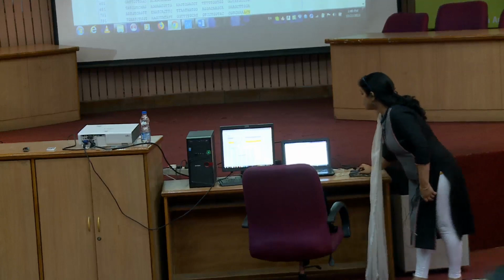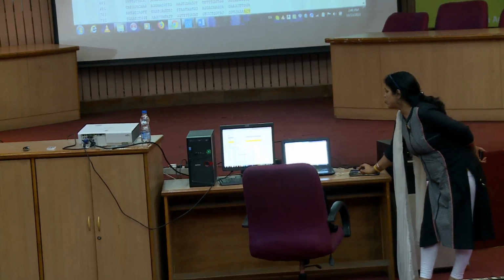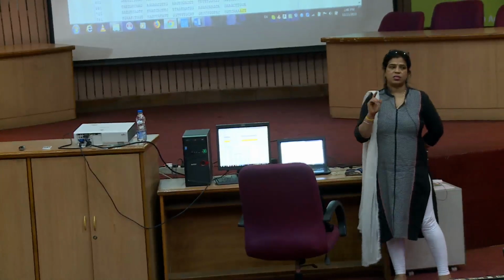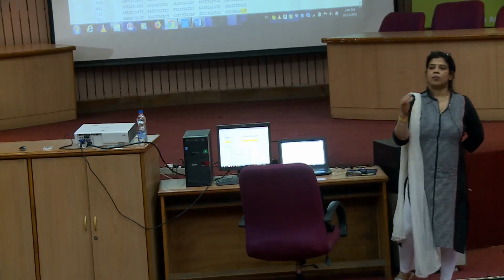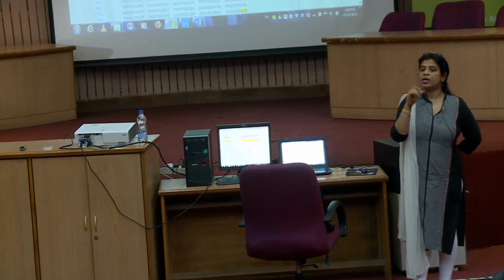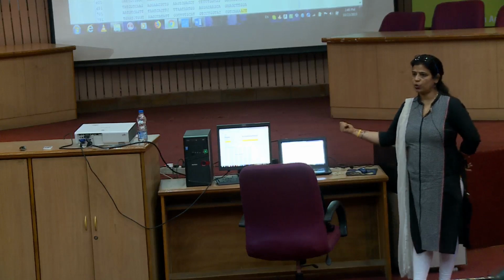So, it will give you these two primer sequences. This is the forward one and this is the reverse one. Another thing, a mistake people generally make in the beginning: the forward primer sequence is actually the sequence of the gene which you are putting in over here.